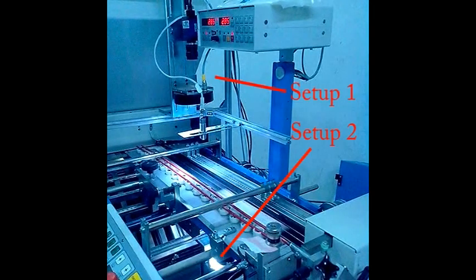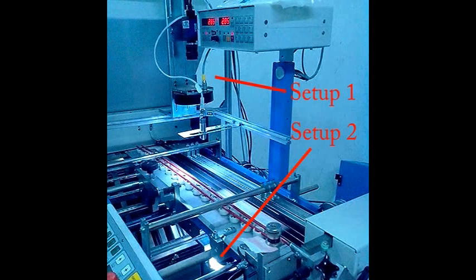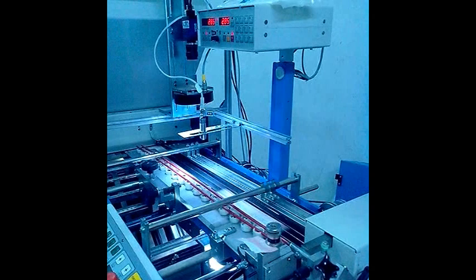The two setups installed on the moving production line are shown here. This enables the top view and bottom view check for print inspection.